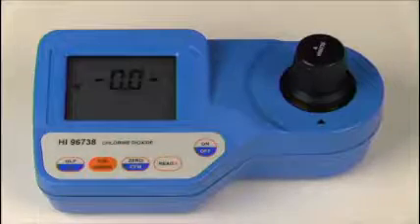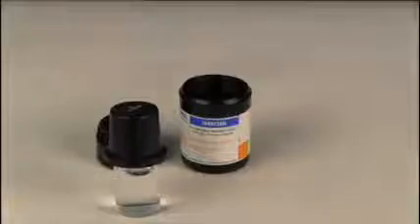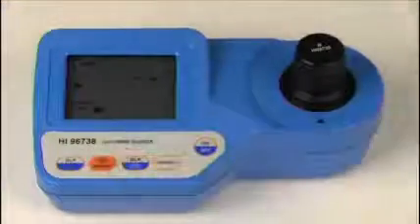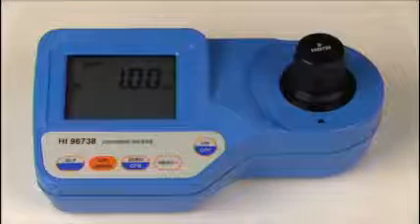Next we will perform the CalCheck on the 25 degrees Celsius standards. Remove the HI-96738B one milligram per liter cuvette from its container and wipe it of any dust or prints. Place the cuvette into the meter and index it. Press the CalCheck button to read the one milligram per liter standard. It is important to press the CalCheck button and not the read button when using CalCheck standards. We obtained a reading of one milligram per liter.